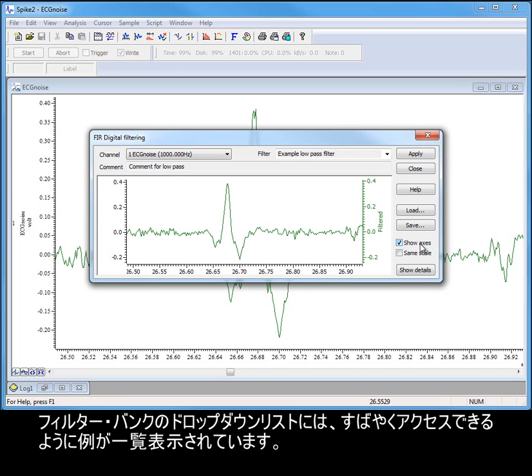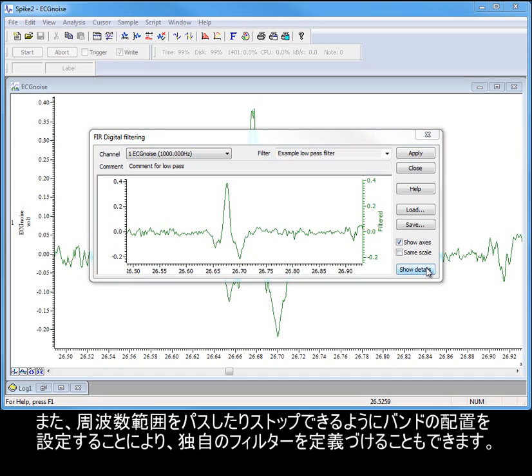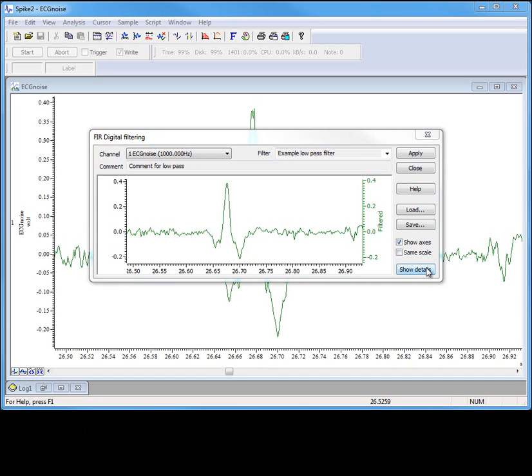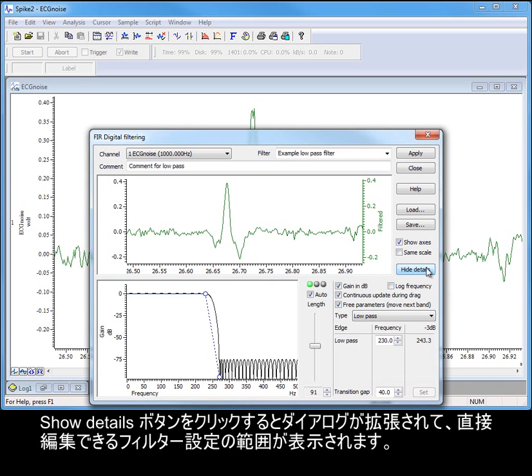The filter bank drop-down holds a list of examples for quick access, but we can also define our own filters by setting up an arrangement of bands for passing and stopping frequency ranges. Clicking on the Show Details button extends the dialogue to show a range of filter settings that can be edited directly.